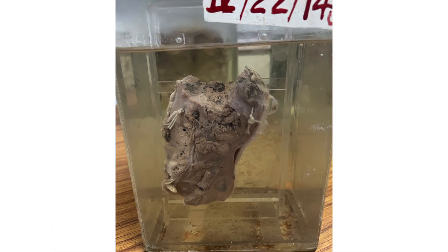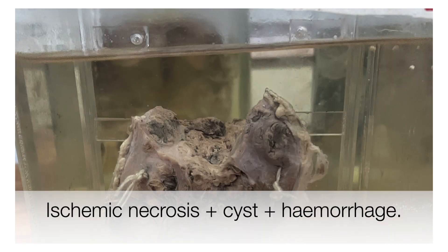Following is a large, bean-shaped specimen. The relative superior aspect has been extracted and the cut section shows large areas of ischemic necrosis, cystic changes and foci of hemorrhages.